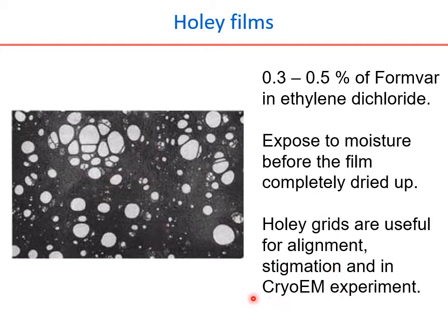And the next one is the cryo-EM experiment. Of course, this grid will be used in cryo-EM experiments for screening. So where exactly is the cryo-EM experiment useful? For this, I will take a small break here from the Holey films, and I will give you a small narration of how the cryo-EM works.